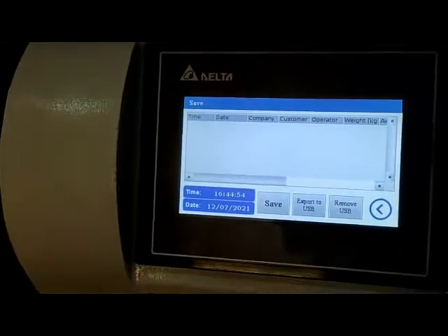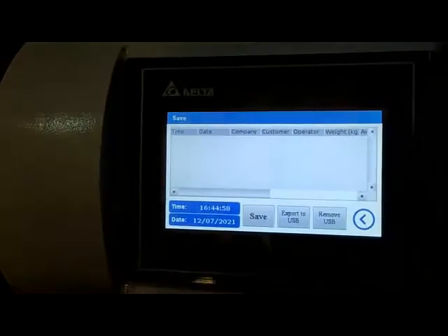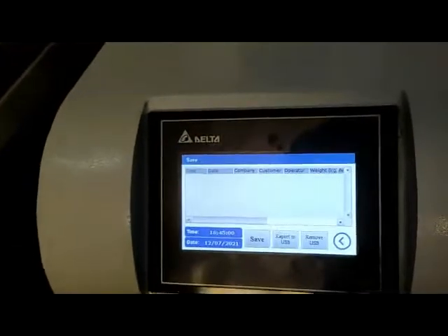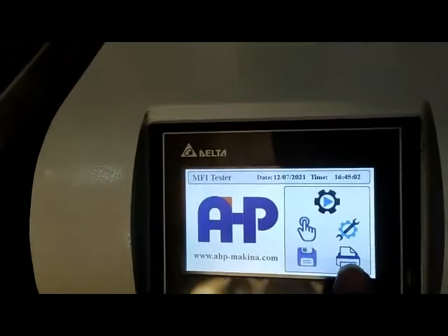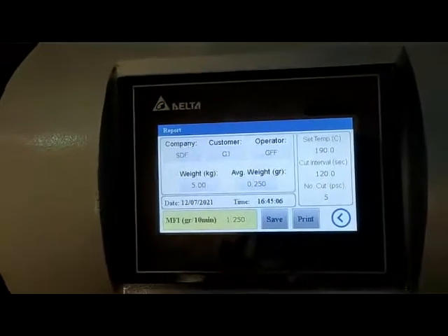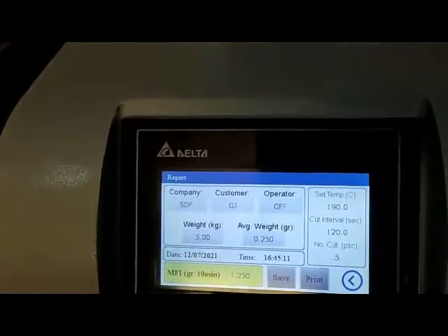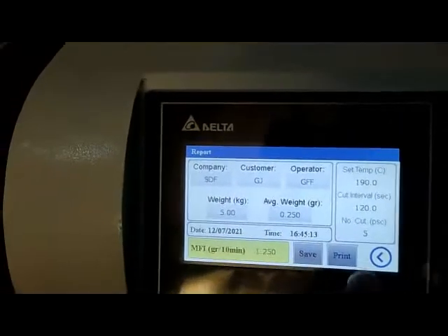In this menu you can export the reports to a USB flash drive and analyze them on a computer. This menu is for calculating the MFI, and you can also print the reports from the thermal printer.